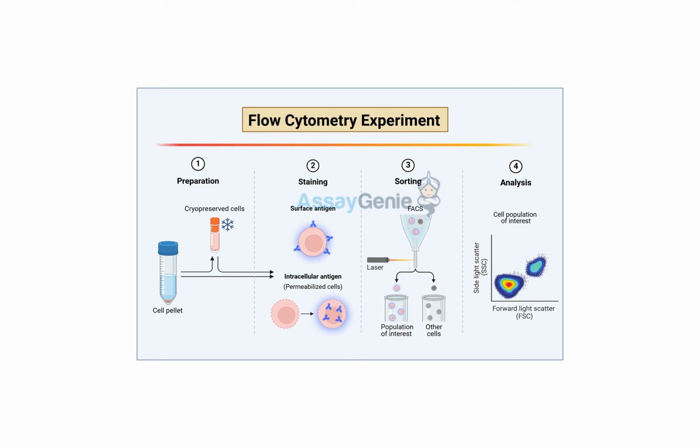Where they bind strongly to their target, but don't create a lot of background noise. So it's like fine-tuning the signal, making sure it's nice and clear. Exactly. Now, I remember reading about these fluorescent tags that are attached to the antibodies in ICFC. What do those do?